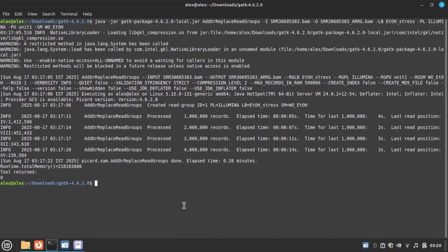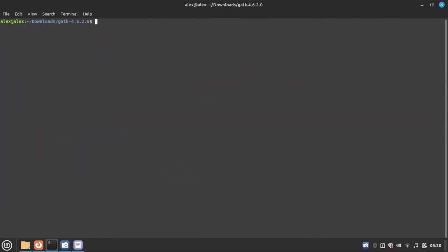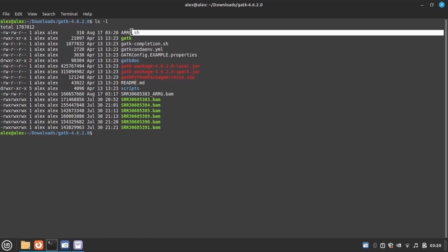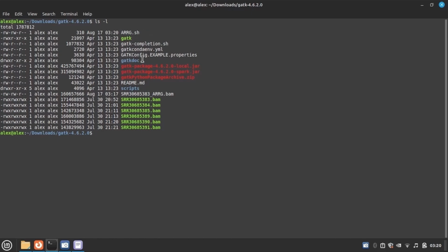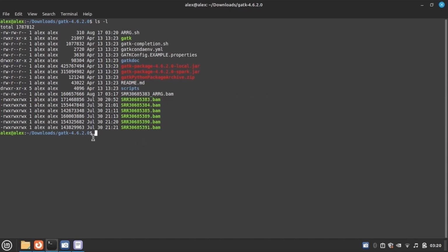Now just check the list. Clear it and list. Here you can see this is your script. You have to run this script to analyze these files.